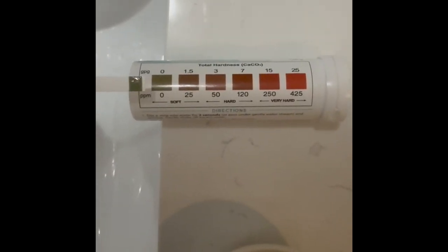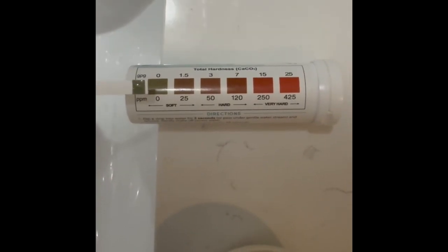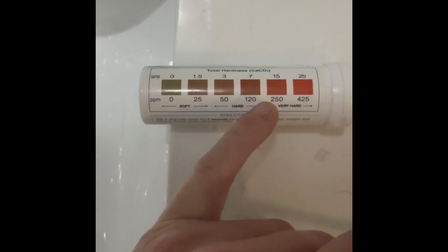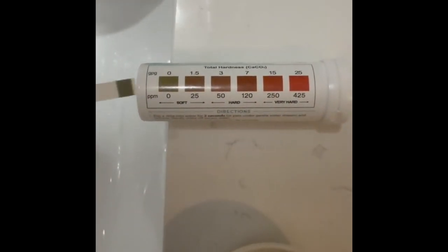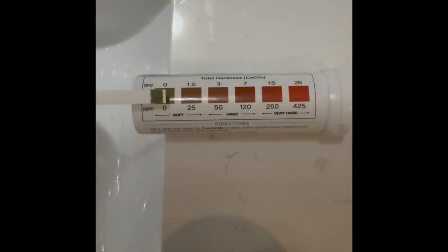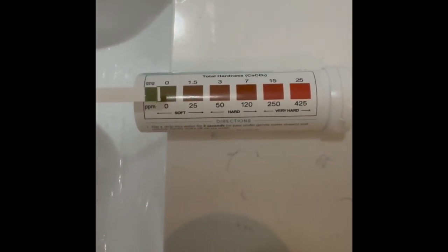And here's after 30 seconds, you can tell the water is completely soft. Before, we were over here between 7 and 15. Now it looks like we're darker than even 0, so the softener's doing its job.